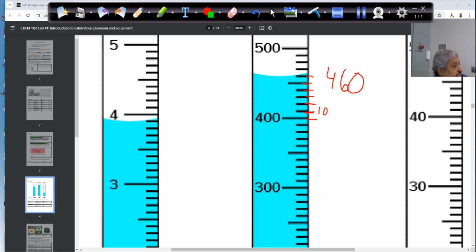Well, to have a precise reading of a graduated cylinder, you have to read 2 digits after the decimal. Burettes and a graduated cylinder will have to have 2 digits. So I will write 460 and then put 2 digits after the decimal as zeros. Are you following me here? The unit is milliliter. And the whole subdivision is what? 10.00 ml. Each subdivision is this one here.